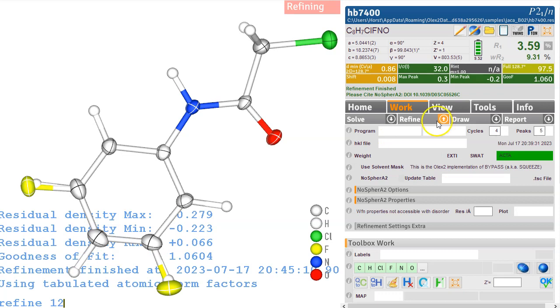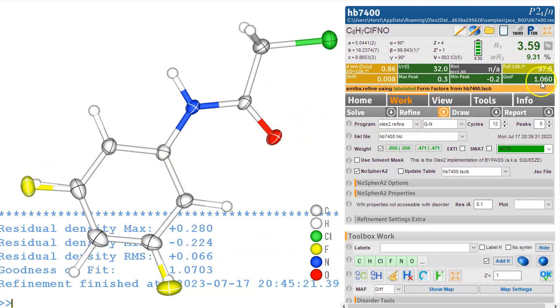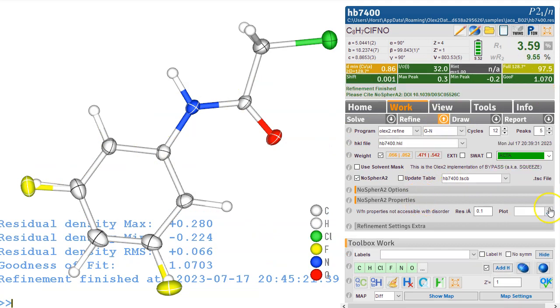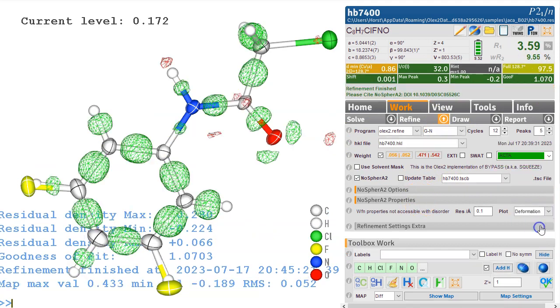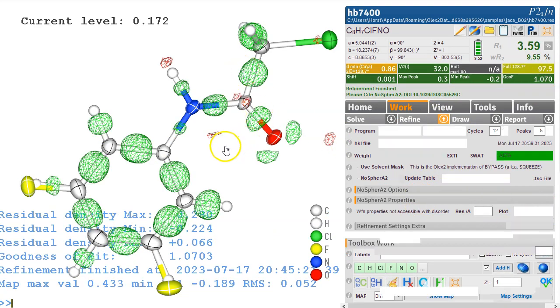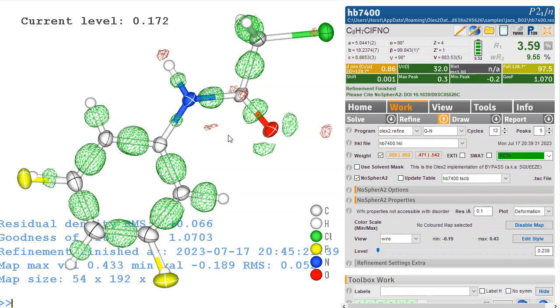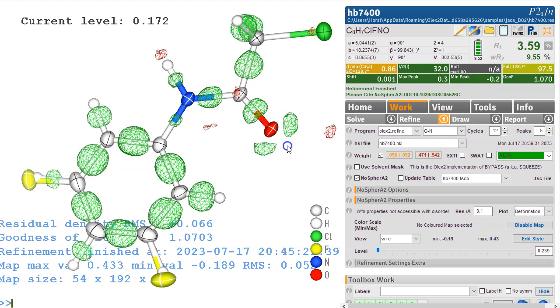So we can look at the properties, so one of the properties we're interested in is a deformation density which is effectively the difference between the independent atom model where every atom is just a sphere and we don't take bonding, lone pairs, none of this into account, and then the non-spherical form factors where we do take bonding and lone pairs into account and you can see the lone pairs beautifully here.